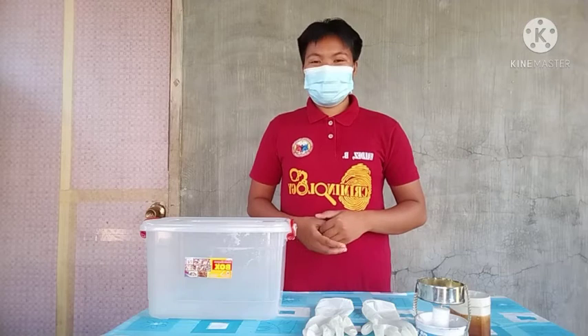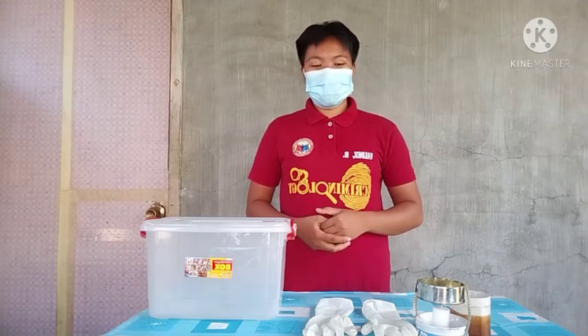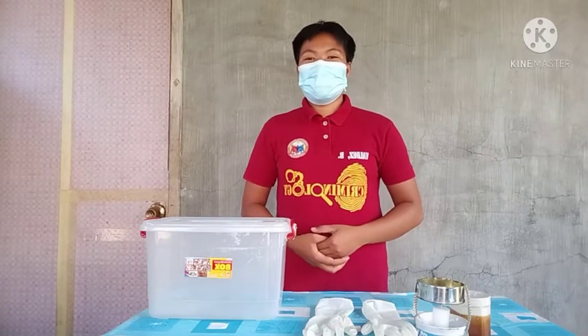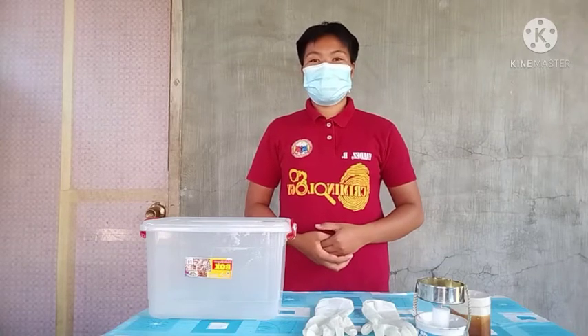Good day everyone. I'm Baby Rose Valdez from BS Cream 2-1, and today I will demonstrate how to develop a latent print using the cyanogas treatment method and the fuming box method.